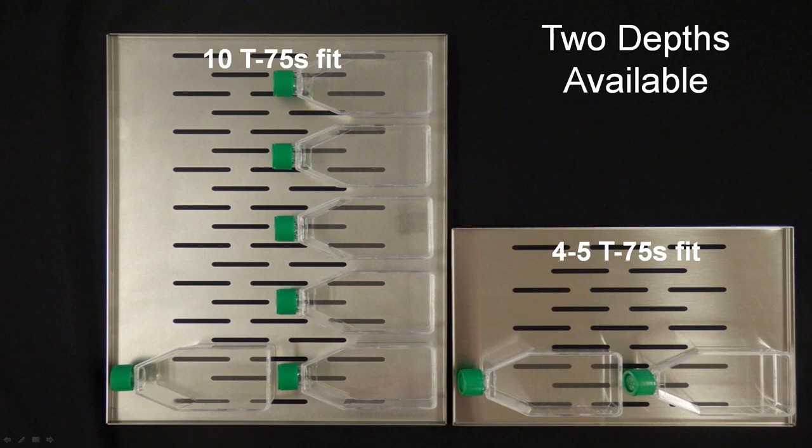You might notice that we turn these shelves so that the edges are upward, and these cell culture vessels can then be nestled down inside the shelf instead of sitting on top the way that you see in a traditional room air CO2 incubator. It's just more secure for the vessels, because we do a lot of sliding the shelves in and out in order to bring those into the processing chamber area as we access things. So this is a deliberate choice.